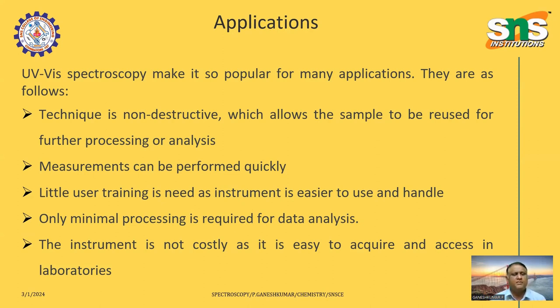The measurement can be performed quickly. Within 5 minutes, we can finish the measurements. Little skill is required for this; little training is enough to handle the instrument. And there is very minimal processing in the data analysis. The instrument is not a costly one, so even many industries or institutes can avail it.